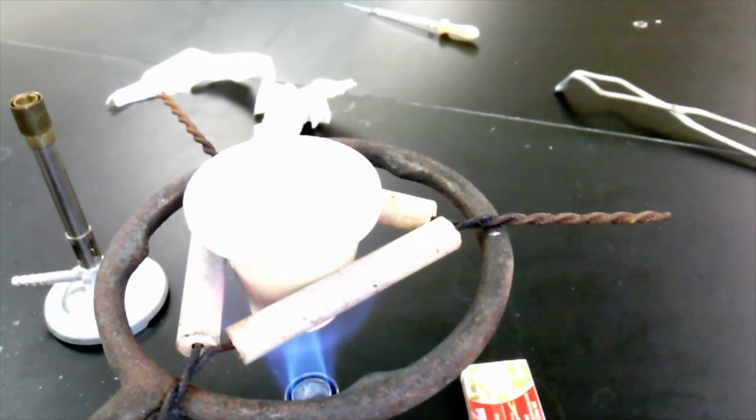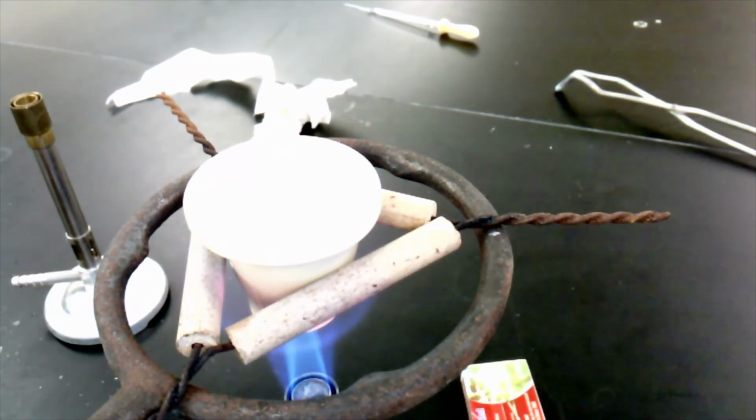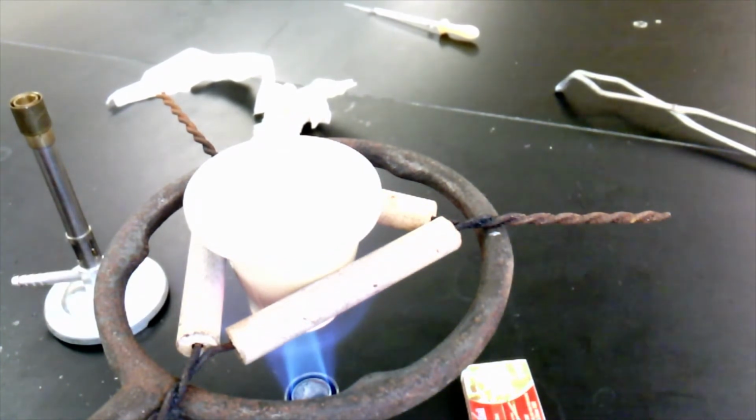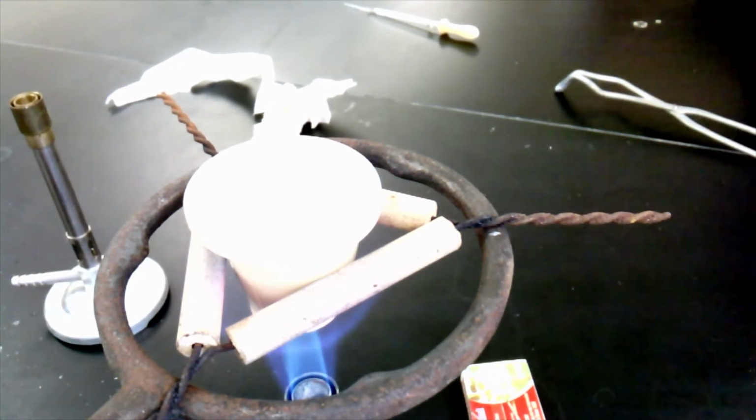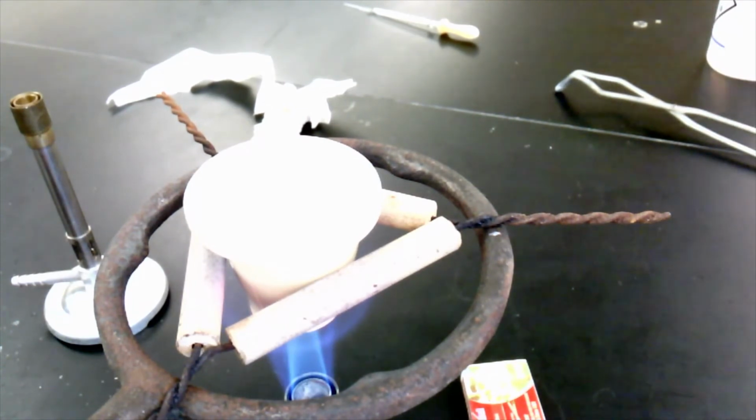Oxygen is not the only thing that's in air. There's something else that it could be reacting with, which is nitrogen. So once we think this is all done burning, it's stopped showing any evidence of reacting, we're going to have to take one more step to get rid of the magnesium nitride that forms. You should be able to predict the formula for magnesium nitride based on your charge rules and your naming like we had on the exam on Monday.